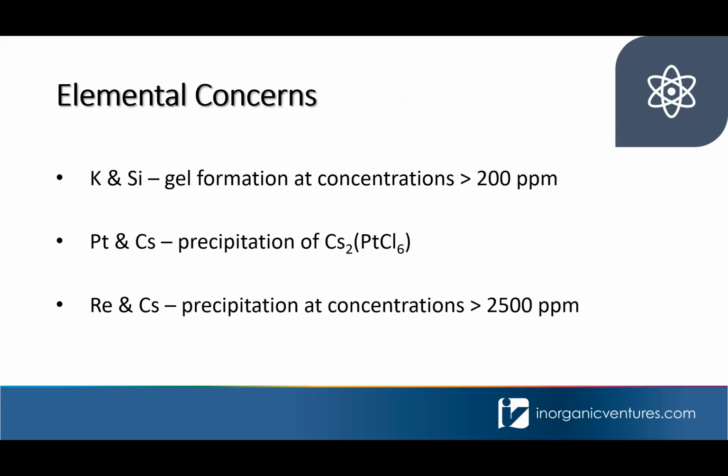All right, first up, we'll talk about inter-element concerns. Inter-element compatibility must be considered when designing stable CRMs. The following guidelines are observed at Inorganic Ventures. We have a standard operating procedure for the quote process that includes everything that I'm talking about today. So we follow these when we're creating custom multi-element standards.